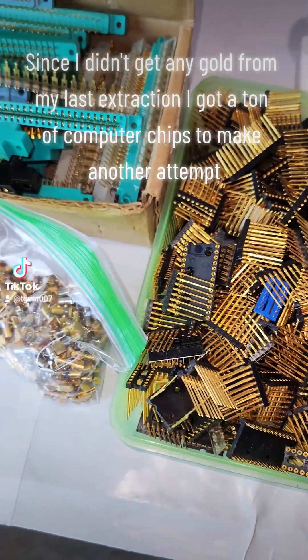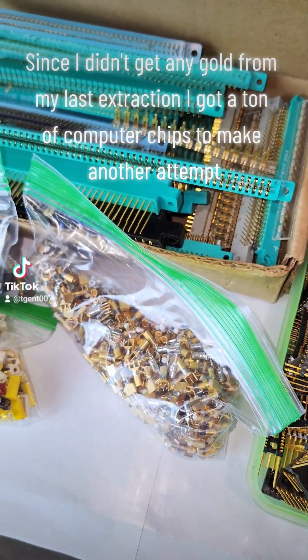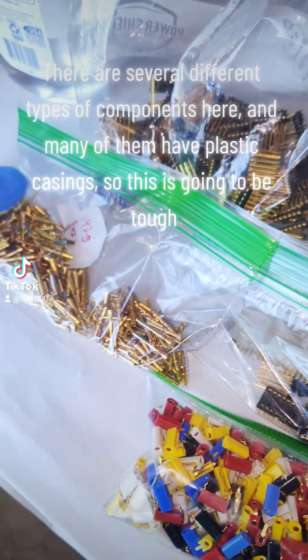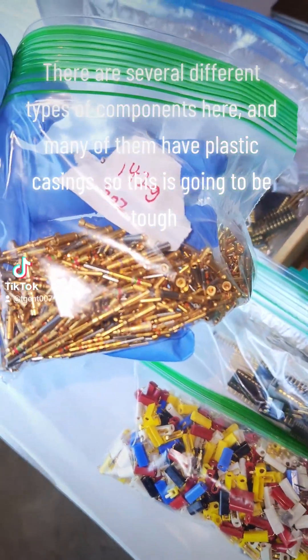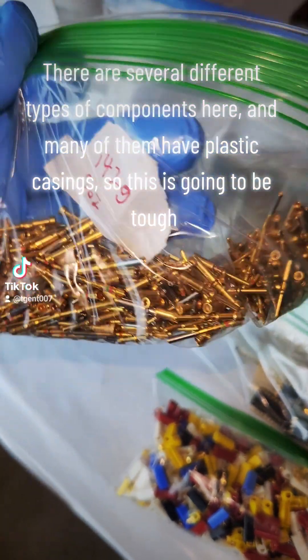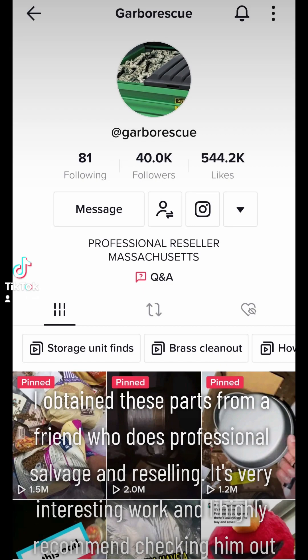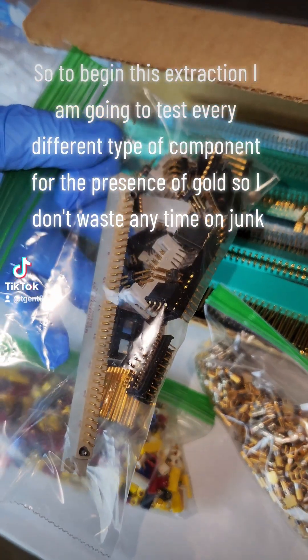Since I didn't get any gold from my last extraction, I got a ton of computer chips to make another attempt. There are several different types of components here, and many of them have plastic casings, so this is going to be tough. I obtained these parts from a friend who does professional salvage and reselling. It's very interesting work and I highly recommend checking him out.